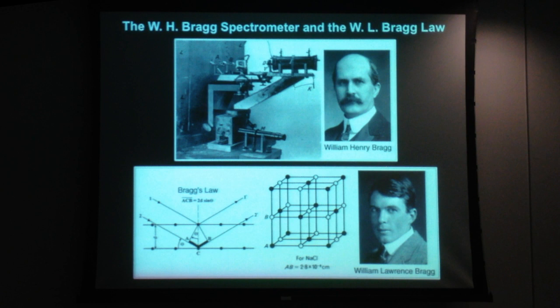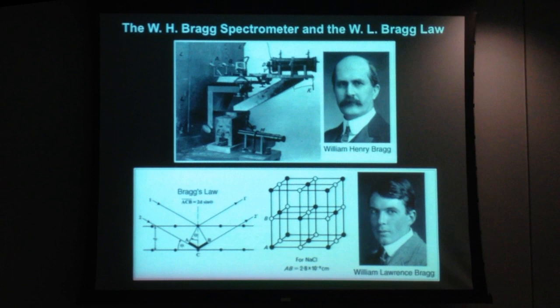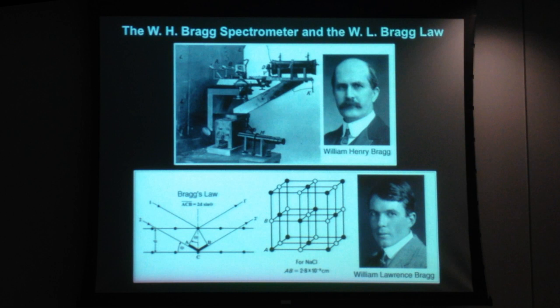So we're measuring X-rays coming off of a specimen C here. So here's a big crystal, right? X-rays coming along through this direction and rotating the crystal, giving the different spectra. Discrete beams coming off as we rotate the crystal to bring each family of planes into equal incidence, equal scattering condition with the X-ray beam.